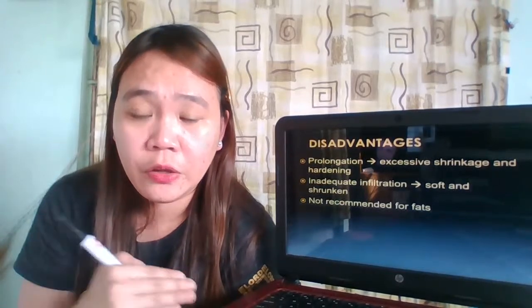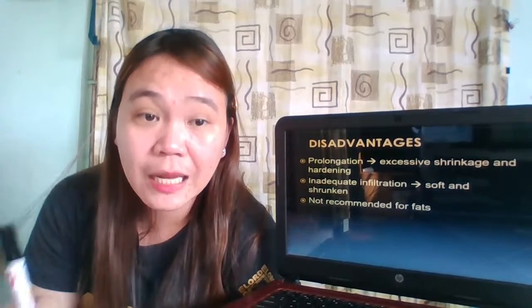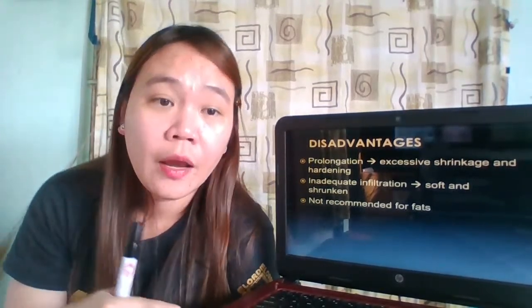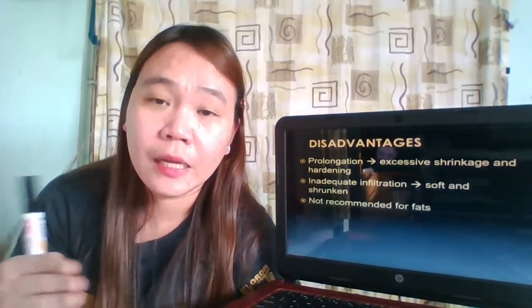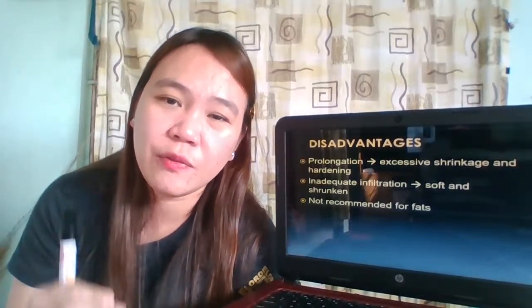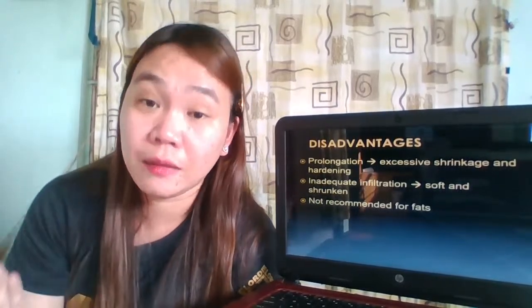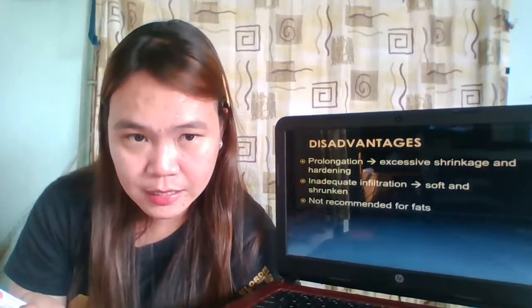Prolonged immersion in your paraffin is really needed for samples which are difficult to infiltrate. So what are examples of specimens which are difficult to infiltrate? We have bones, teeth, brain, eyes.